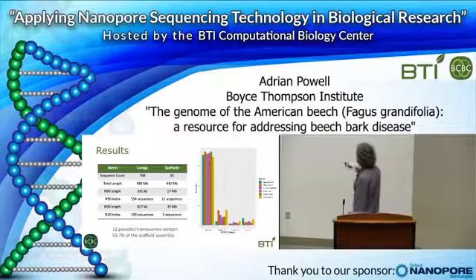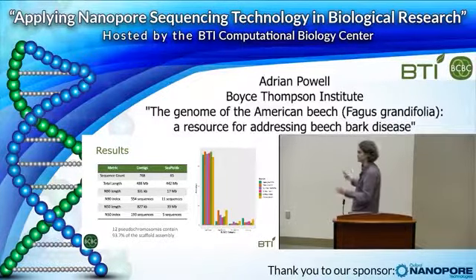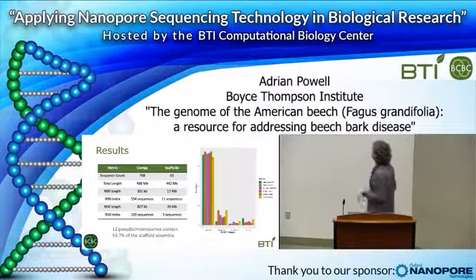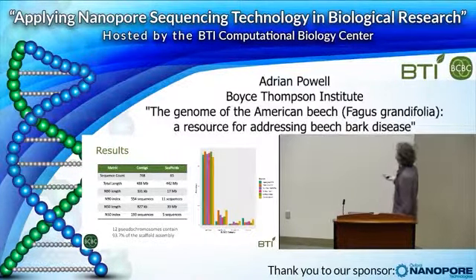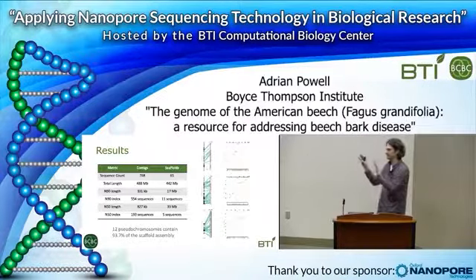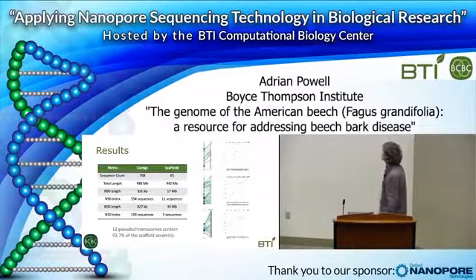In terms of the scaffold assembly, the thing that we're pretty happy about is we're expecting 12 chromosomes, and after that ALLMAPS step, we were able to get 94% of the scaffold assembly onto those 12 pseudomolecules. So we're pretty happy about that. And most of that came from the ALLMAPS step, so basically mapping the markers from the genetic map onto our scaffold assembly, and then maximizing the collinearity between the scaffolds assembled in pseudomolecules and what's in the genetic map.